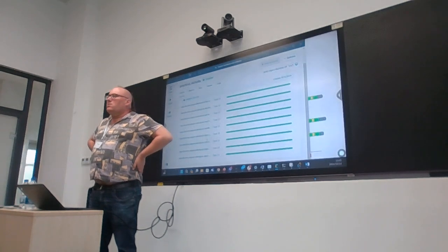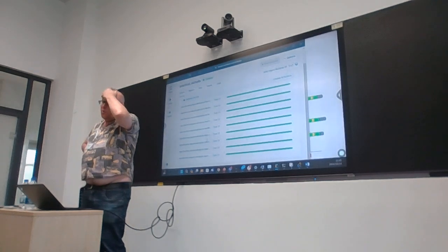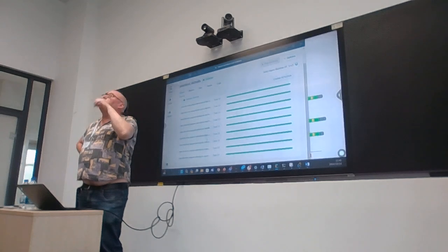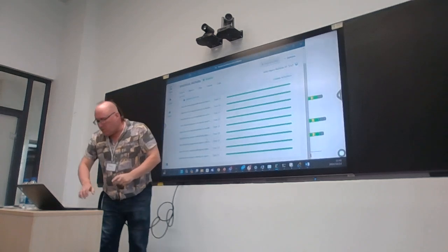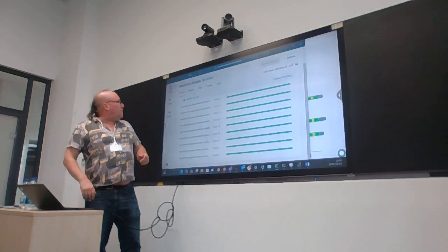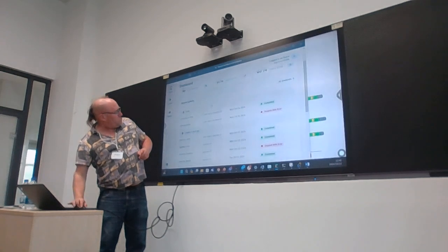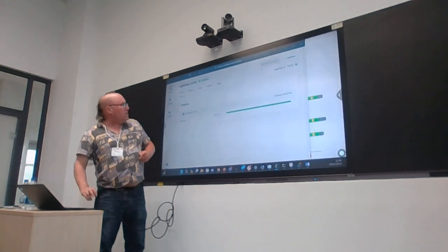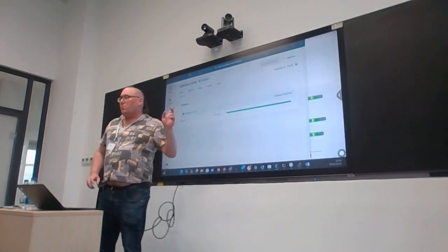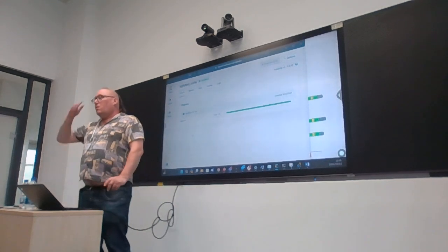Yes, Stephen. From the workflow, does it also mask the repetitive regions? The Squirrel section does that. No, the workflow doesn't; Squirrel checks for repetitive regions. After we run this workflow, there's this tool called Squirrel, and I'll show you how to run Squirrel as well. And that masks repetitive regions.